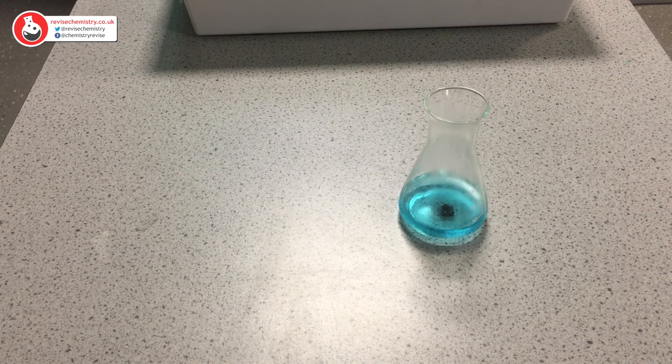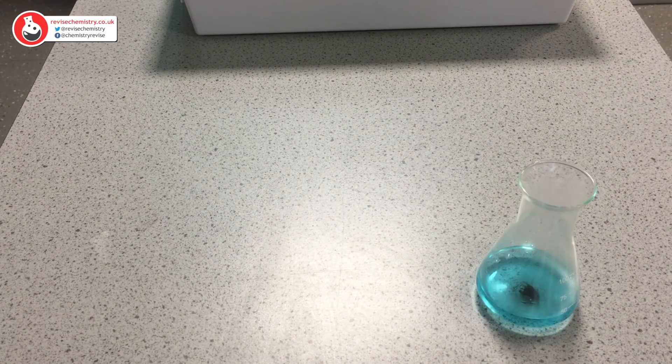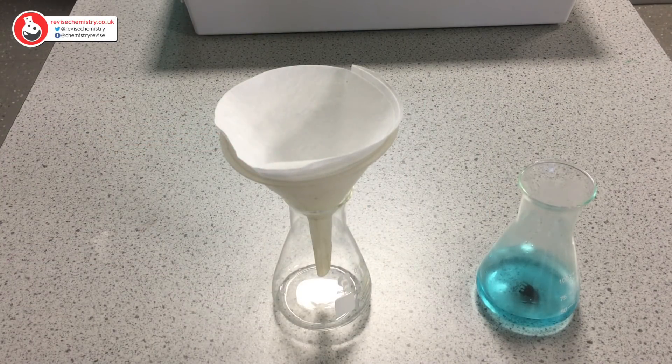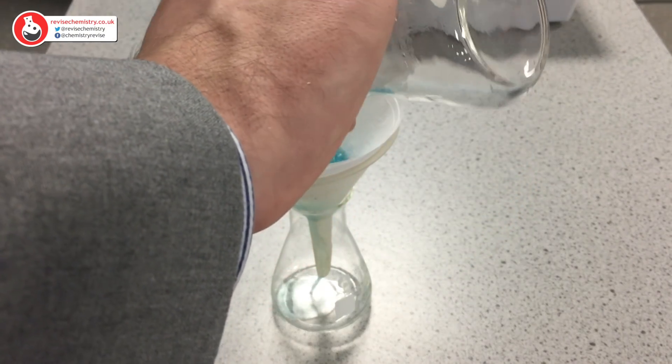The copper sulphate solution must now be filtered to remove the remaining copper oxide. To do that we're going to need another conical flask, a funnel and some filter paper. All we're going to do is simply pour our copper sulphate solution through the funnel.